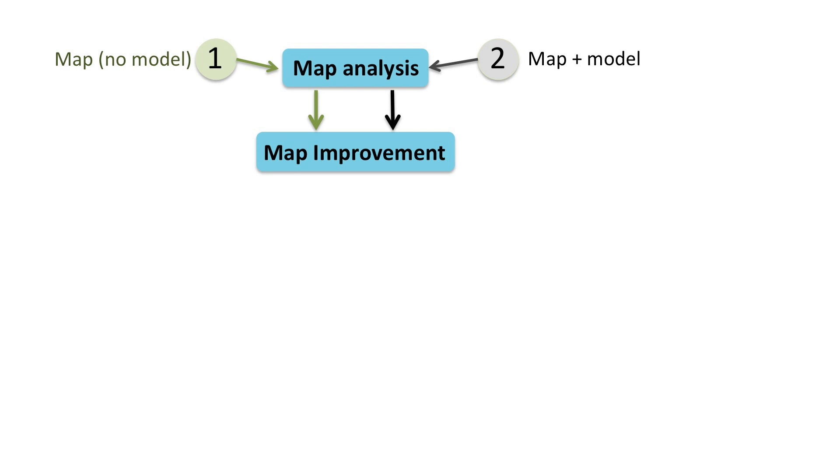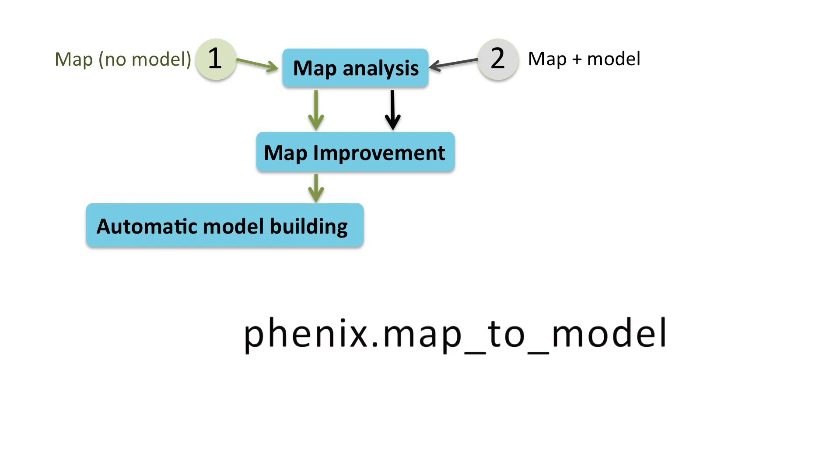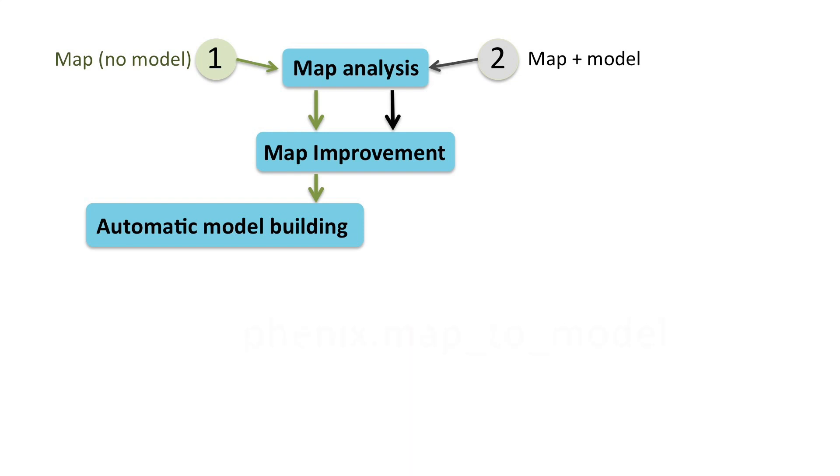If there is no initial model available, it has to be created before advancing to the next steps. Automatic model building can be performed with the tool Map to Model.